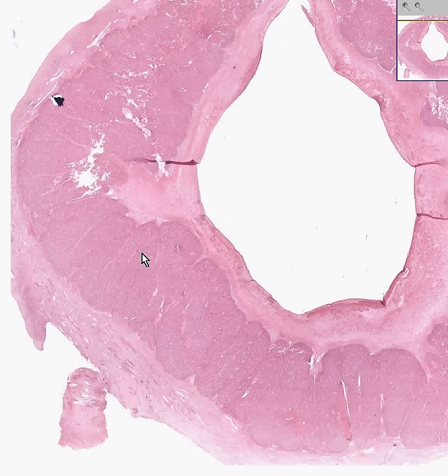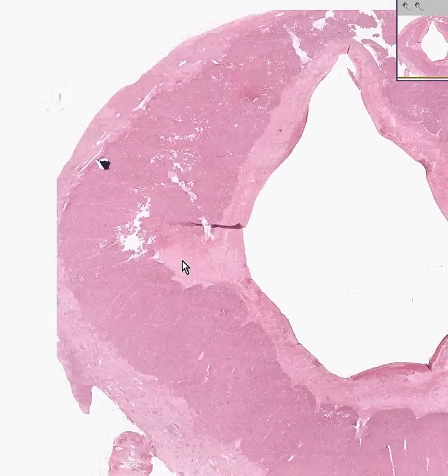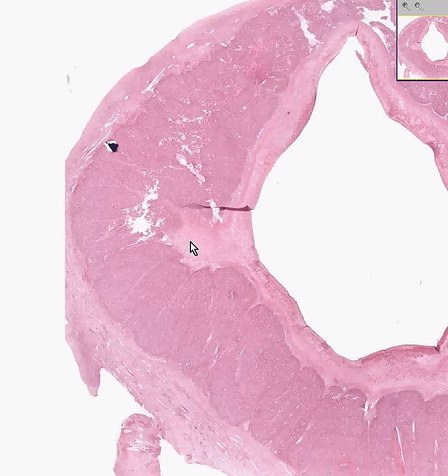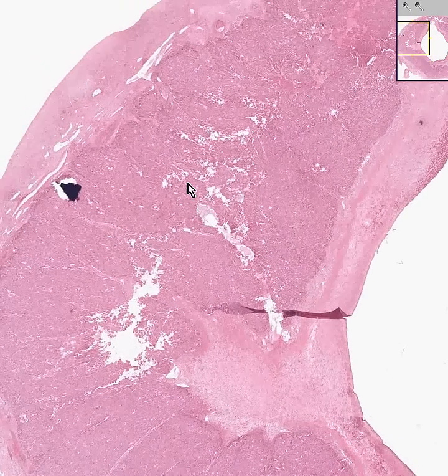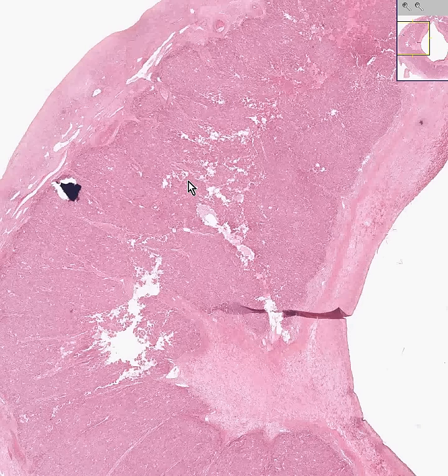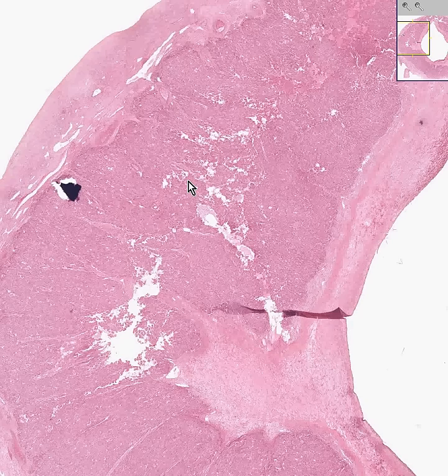There's a little connective tissue and a lot of blood vessels in between the luteal cells, and there's a lot of fibrous tissue towards the outside, with probably a lot of hemorrhage towards the inside. This is a classic corpus luteum — because it's so big, I suspect this was a corpus luteum of pregnancy, the primary producer of progesterone to support the pregnancy and the placenta, primarily under the influence of pituitary LH, or luteinizing hormone, which stimulates these corpus luteum cells.